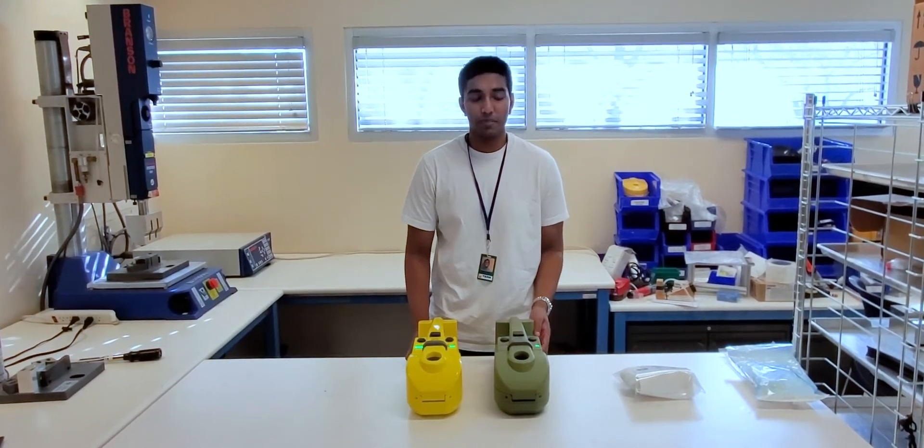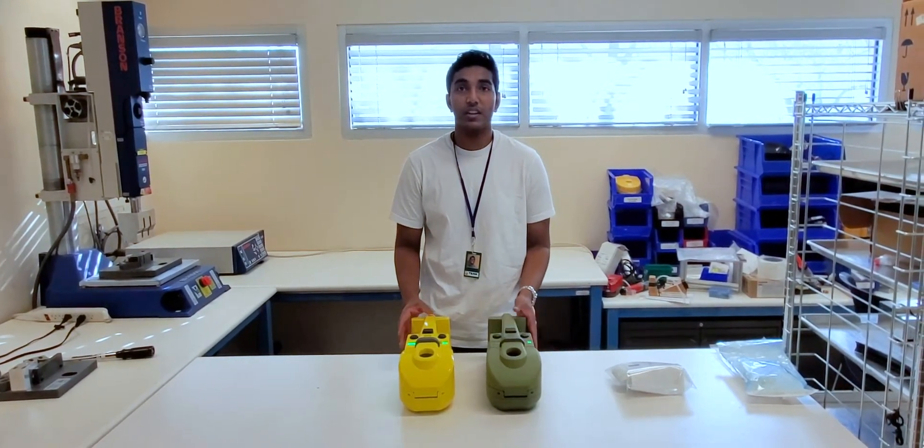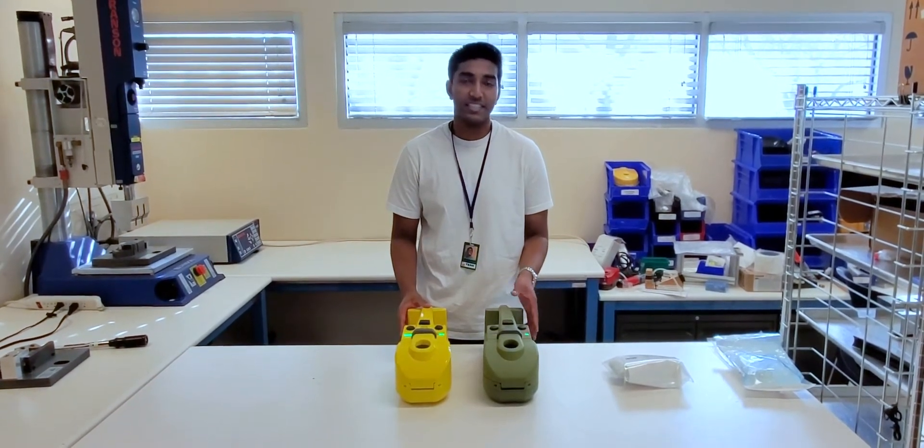As you can see, the Z750 comes in two different color variants: green and yellow. Other than the difference in color, the models are exactly the same.